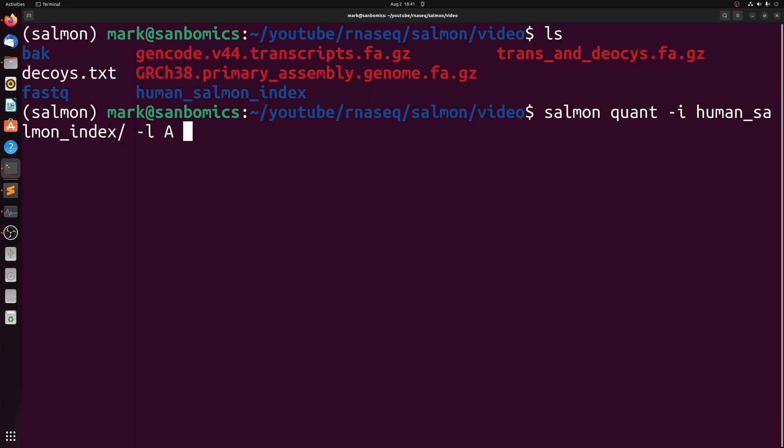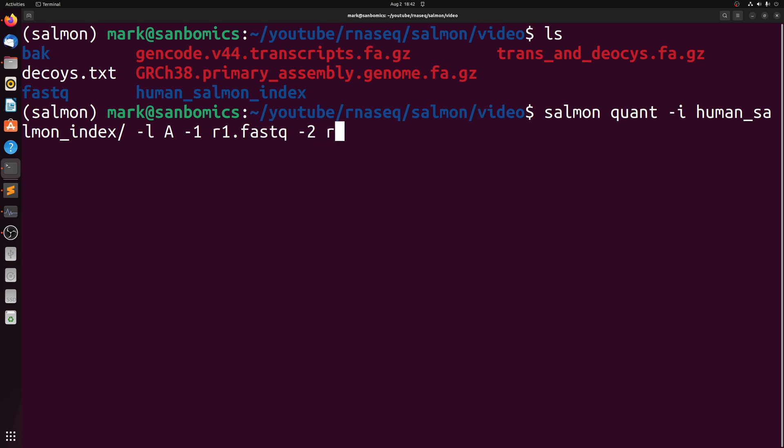And then if you have single read files, you're going to pass dash R and then the path to your FASTQ, but we have paired reads. So we're going to do dash one, and then this is going to be the path to the R1 FASTQ file. And then dash two is going to be the path to the R2 FASTQ.